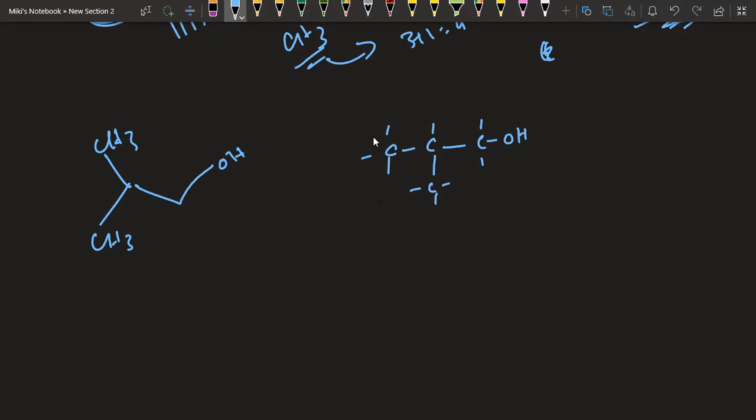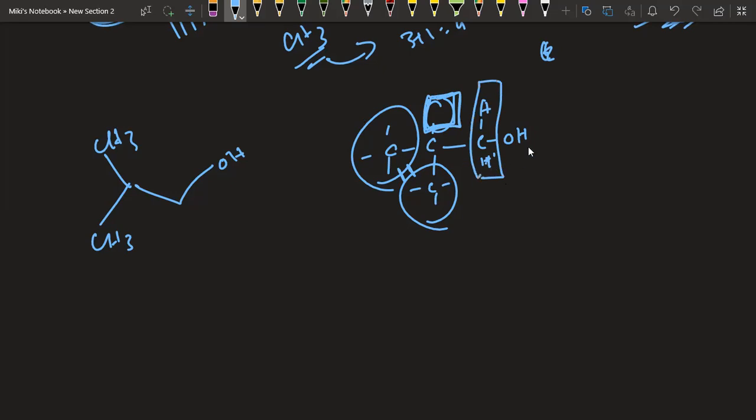Okay, now see how many environments we can find here. One is this one, isn't it? But here you also have CH3. Now see if they are connected to the same carbon. Yes, that means these two are the same environment. Here we have another hydrogen. So the second environment in this case is this hydrogen. In this case, we have these as an environment, and this is a separate environment. So how many environments in total? 1, 2, 3, 4. Did you get it?